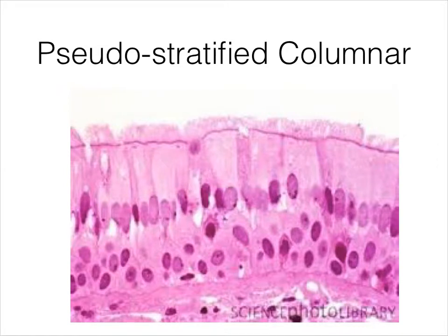This is pseudo-stratified columnar epithelium, and it can be a little bit difficult to tell the difference between pseudo-stratified and simple columnar.